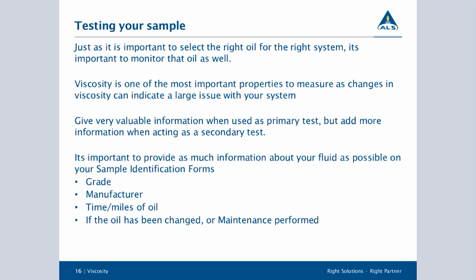You're going to see either things are staying steady, which are just straight lines, or you can start to see things are increasing. And as certain tests increase, especially viscosity, sometimes the recommendation is to change it. Or for viscosity, you can start to see things are decreasing, and we'll refer to that as shearing. So we might recommend that you go up a grade in your viscosity because your thinner oil is just shearing out too quickly. A lot of these things are things that we can help you with, as well as if you provide your oil analysis to the OEMs of either your equipment or the oil you're working with, they can provide you some guidance and assistance with that.